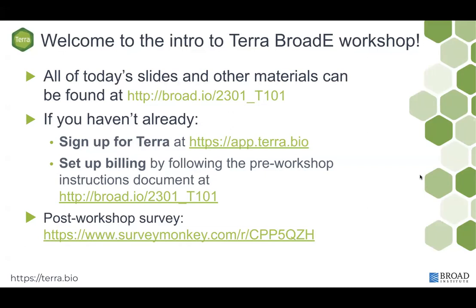So you'll be able to see the billing project that you've been added to in the left-hand menu when you're anywhere in the app on the landing page. And you'll also be able to see it when you are cloning a workspace. There'll be a drop-down menu that says what billing project would you like to use to clone this workspace.